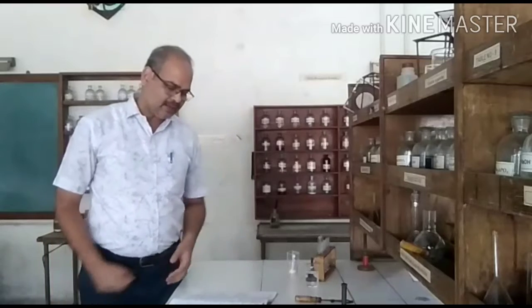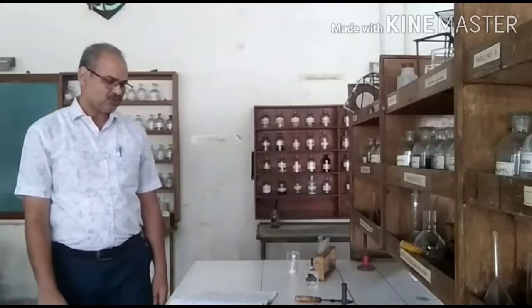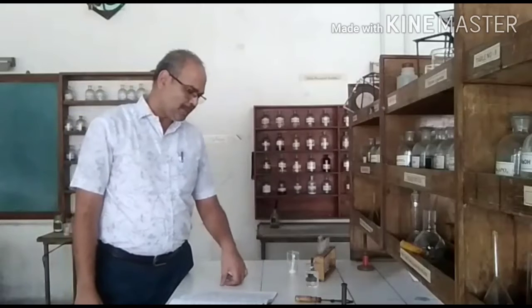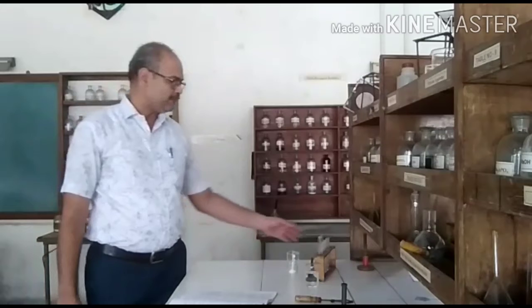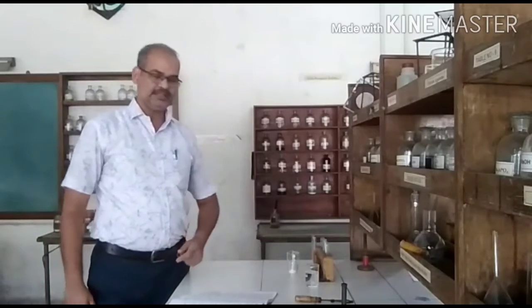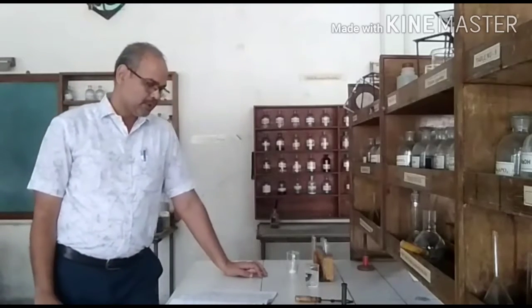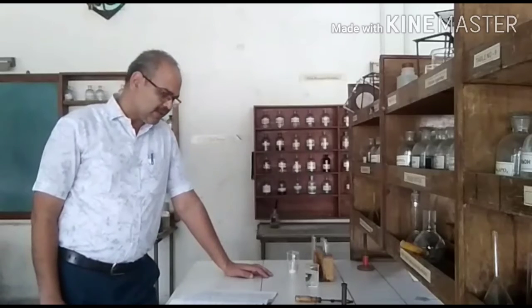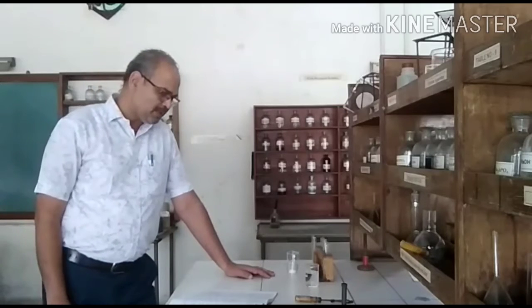Now the second acidic radical which we had detected was SO4-2. The Ct for SO4-2 is given on page number 88. So open page number 88, serial number 11, Ct for SO4-2. You will take OS, add lead acetate solution to it. See the observation. It's a very important test. You will get a white PPT. This white PPT should be insoluble in dilute HNO3, but it should be soluble in hot ammonium acetate.